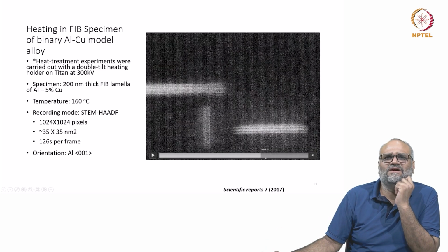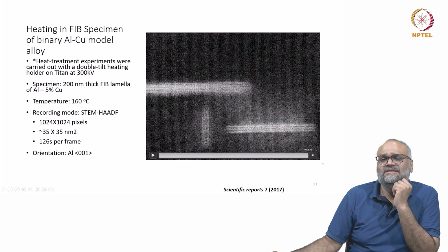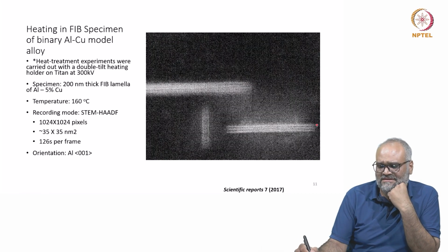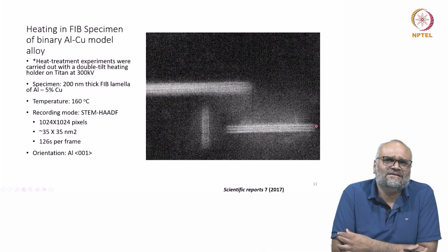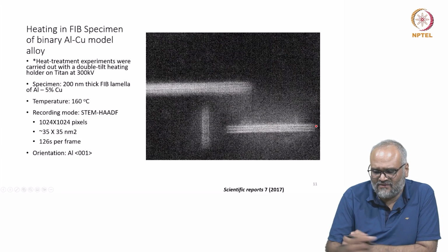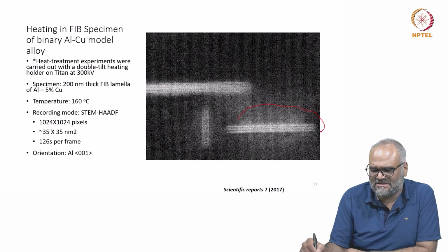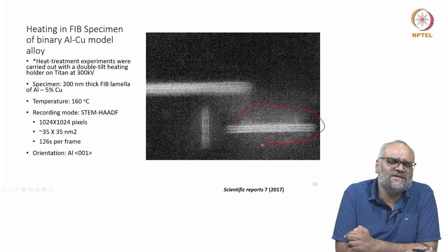And if you go further beyond, you can see that there is a change in the intensity of these precipitates quite strongly, which indicates that there is a strong copper addition happening. And you can also see that at various regions there is this kind of cloud-like appearance which kind of gives you an indication of the solute being diffused towards the trapping site, which is the precipitate here.